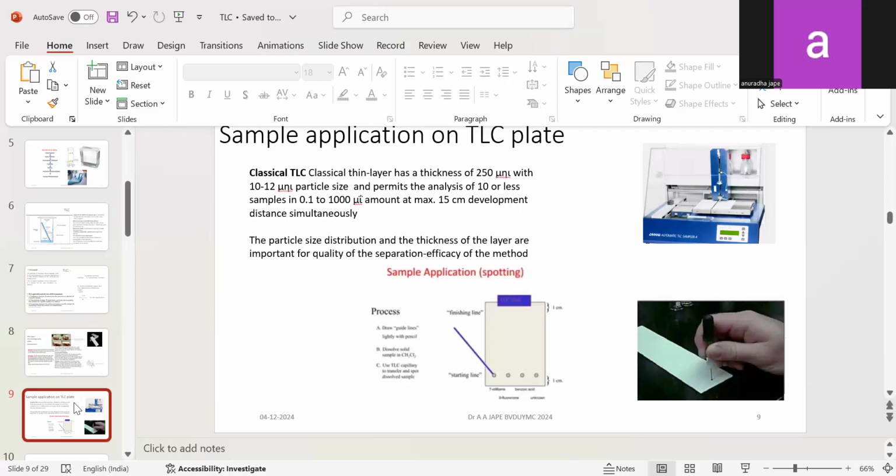So once you prepare these TLC plates, or you buy the commercially available ones, which are also called polyamide layer sheets, which consist of polycaprolactam and are coated on both sides of solvent resistant polyester sheets. They are also available. So, a variety of ready to use TLC plates are there on the market. You have to choose the right one, and of course, cost effectivity is to be taken into consideration.